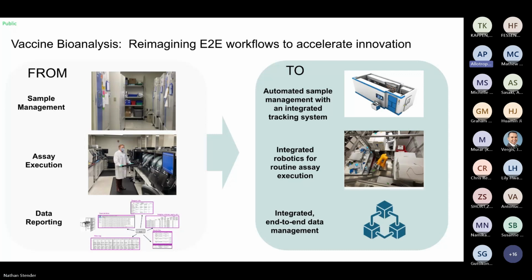Essentially, if you look at this slide going from left to right, it's going from, and we picked the most depressing pictures I could possibly put, this depressing, manual sample management, assay execution, data reporting kind of workflow that honestly I entered Merck a few decades ago doing things like this, to move towards the vision for some of these new bioanalytical facilities of really end-to-end automation, sample management, lots of robotics, maybe not lights out, and really end-to-end integrated sample management.